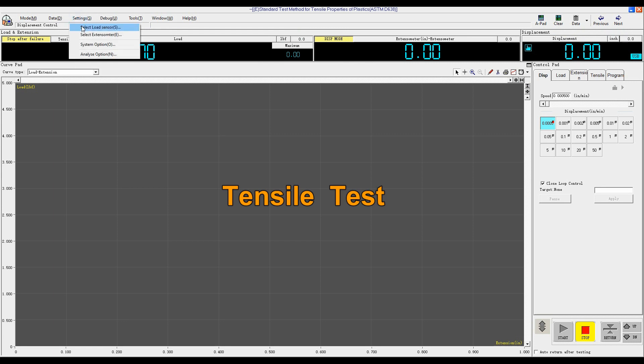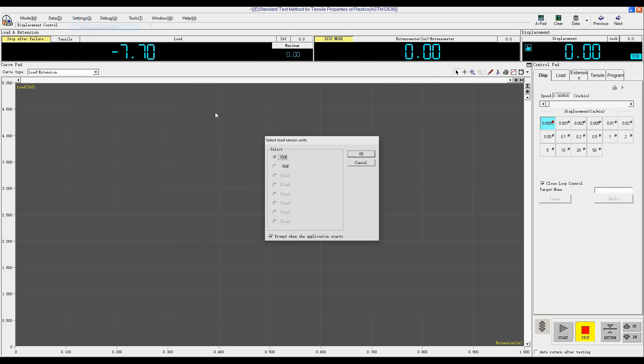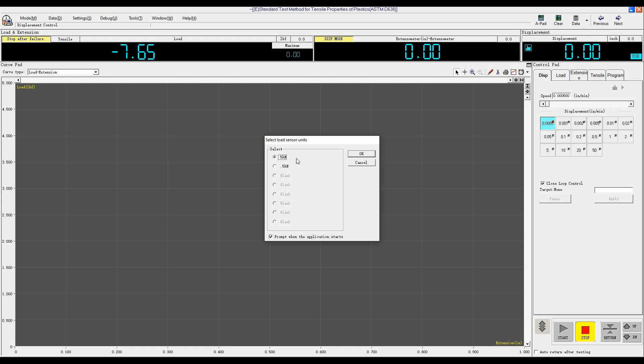Click Settings. Select Load Sensor. You can see, the first one is 5kN. The second one is 0.5kN. Select 5kN. Click OK.